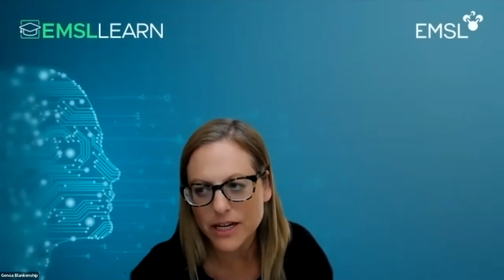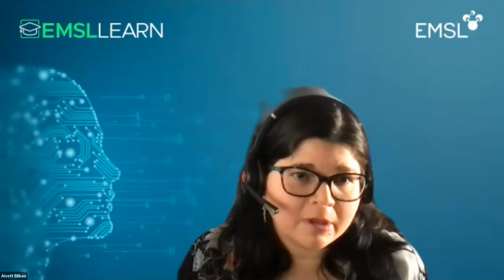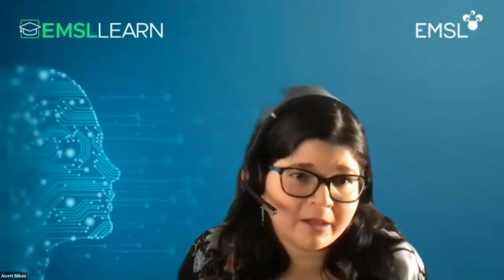Aivett, do you support data analysis workflows other than the specific top-down experiment you mentioned? Right now, we support this specific experiment that we presented, but as David mentioned, his work developing the PSpecteR package will facilitate addressing other kinds of workflows, and we are happy to collaborate and help users get their data, analyze it, and take advantage of it as much as possible.